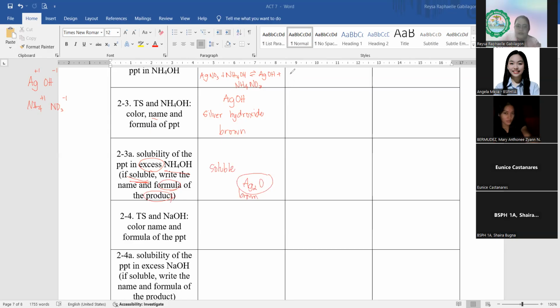Okay? So, ito naman, this one. This is lead nitrate plus the ammonium hydroxide. Tapos, exchange partners ulit. So, Pb will have the OH. Pb and then OH na yung partner niya. But lead is positive 2 and this is negative 1. So, you have to do the crisscross here. Therefore, the correct chemical formula is Pb(OH)2. Okay? So, this is Pb(OH)2. Ano ang naiwan? Ammonium at saka nitrate.